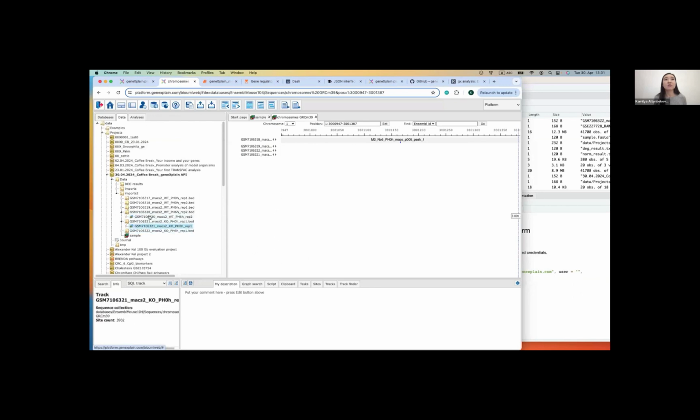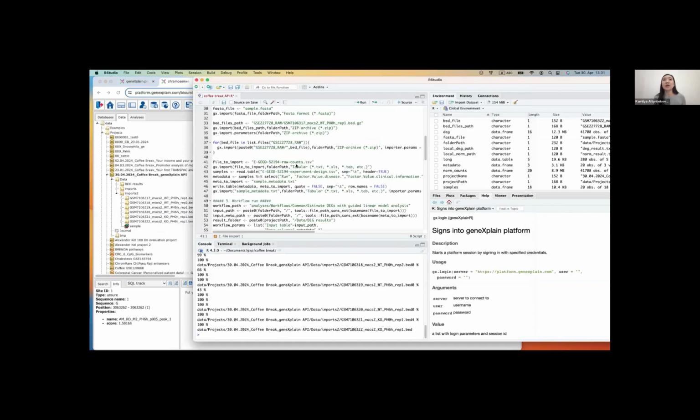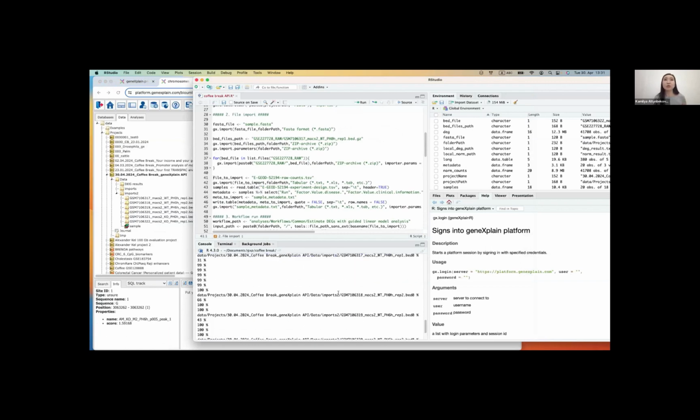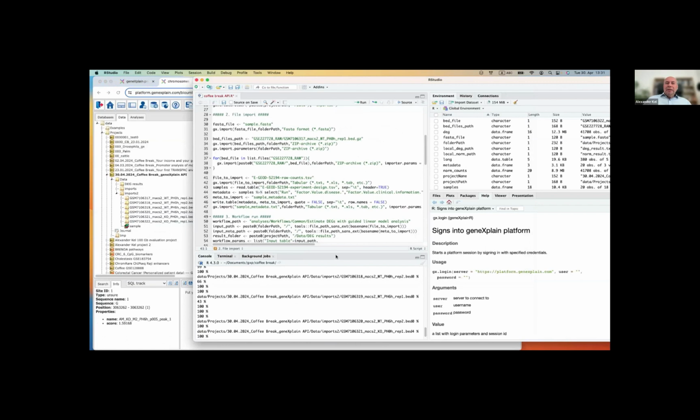if you see now, I'm not asked to actually add sequences because it was already defined in the parameters. So now our tracks are already very much usable by the platform. We already know what the reference for these tracks is, and we can view them or use them as inputs and so on. So this is just some examples for imports. Again, we have a lot of formats which we support.